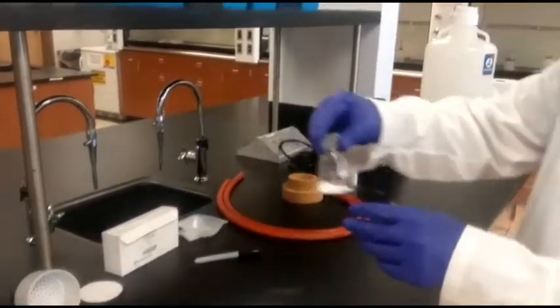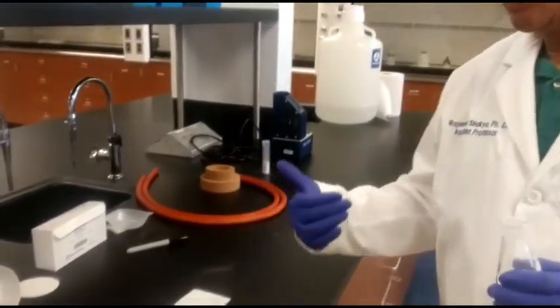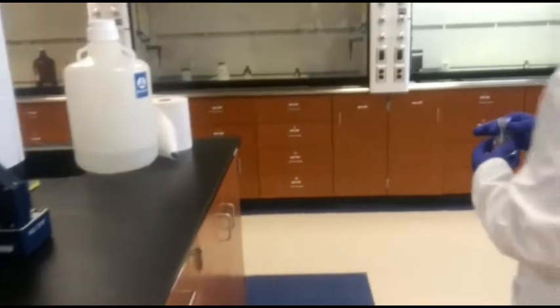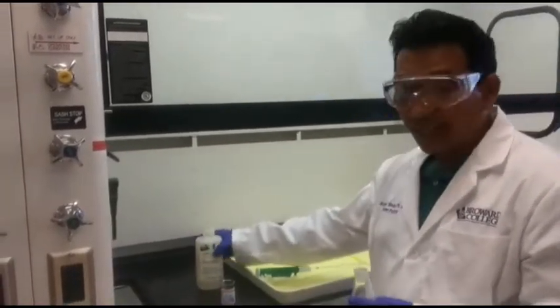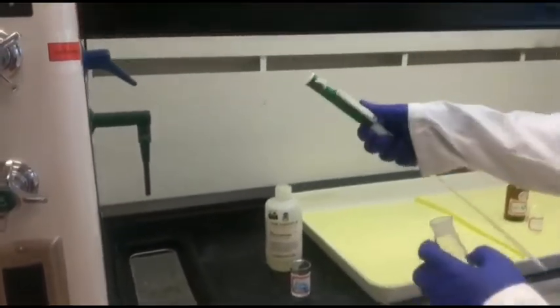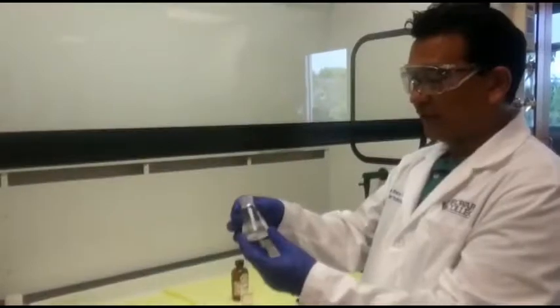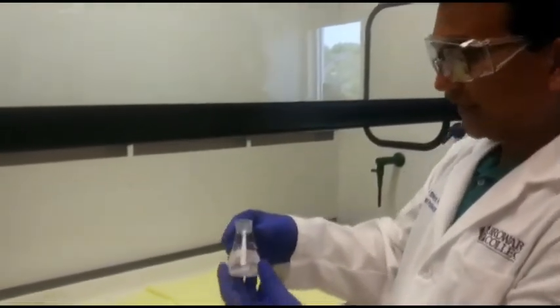Okay, this is salicylic acid. The acetic anhydride and the phosphoric acid we get in the fume hood, because we don't want to expose them to the atmosphere here. I need to add 2 milliliter of acetic anhydride, so I use this pipette to take 2 milliliter. Here is the mixture of salicylic acid with 2 milliliter of acetic anhydride.